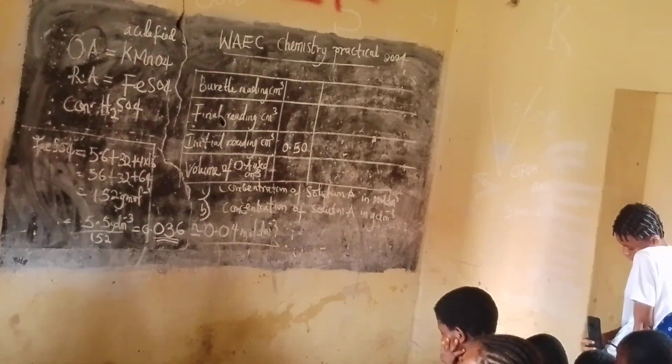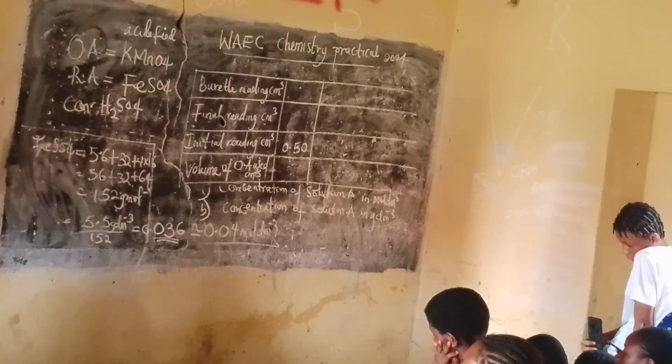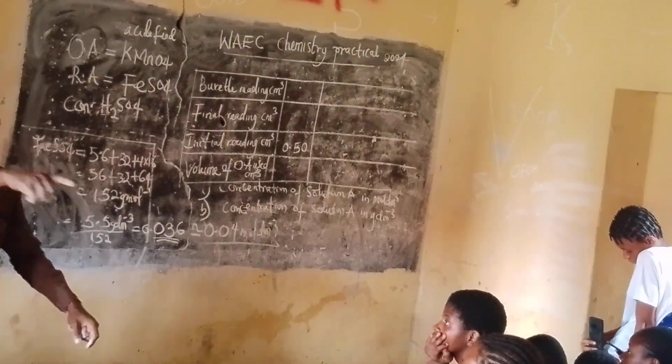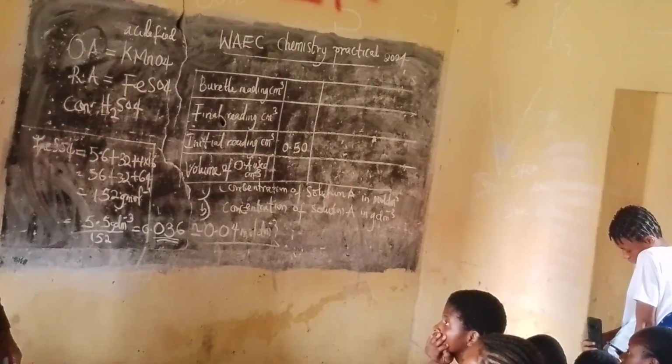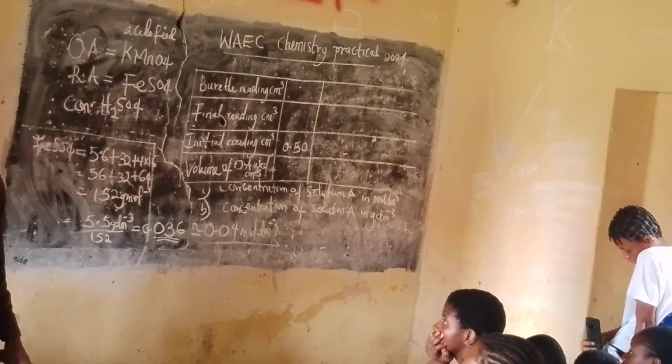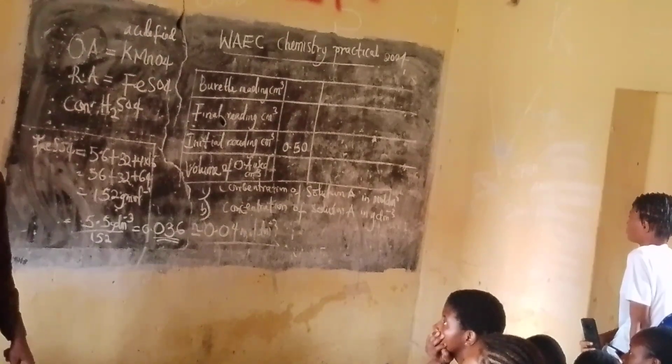Let's assume that's my endpoint. That's what I want to report. And let's assume that's what Uncle gave you to report. See how I'm going to make up my 11.70, and I'll come to what Uncle wants me to report. Uncle will not give all of you to report the same thing because there's a principle of titration.